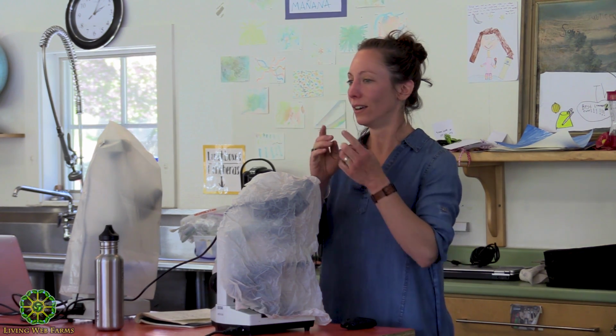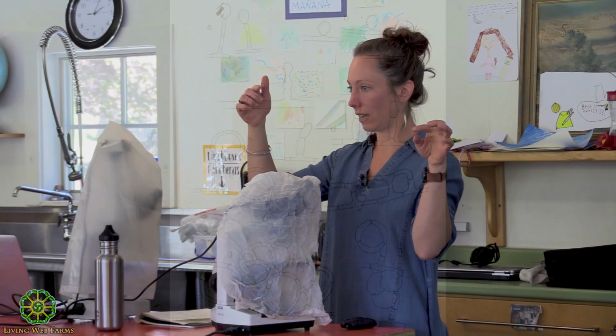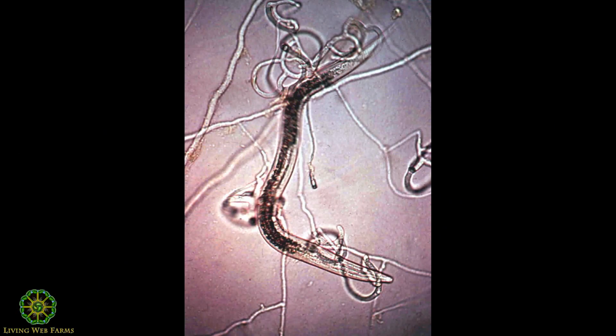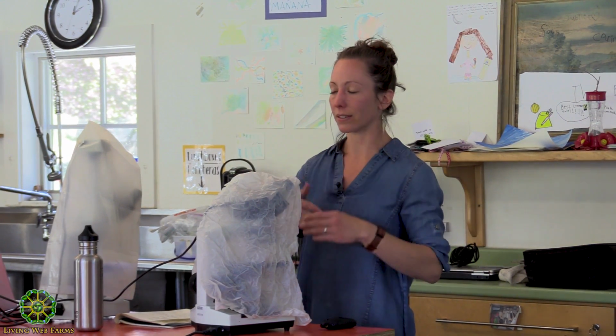So it's like this fungus, there's a couple different kinds, but one creates these little lassos, and if the nematodes even put a piece of their body near the lasso, it'll constrict and trap them. And then it just grows into them and kills them. And it will kill any of these. It doesn't care. But it's one of the ways of keeping some of the other nematodes in check, you know? So nature sort of balances.